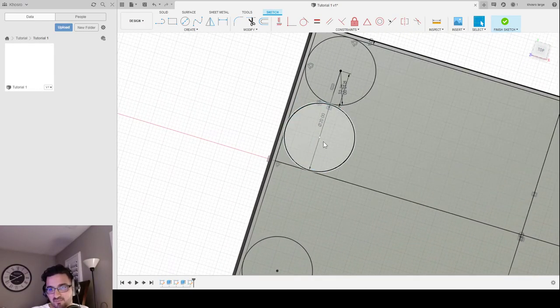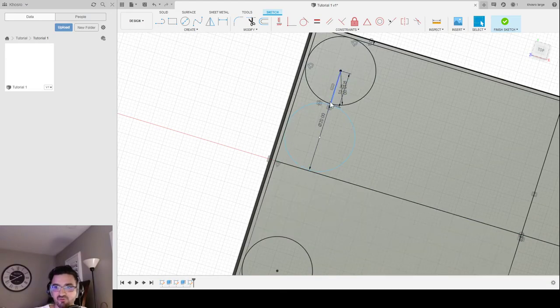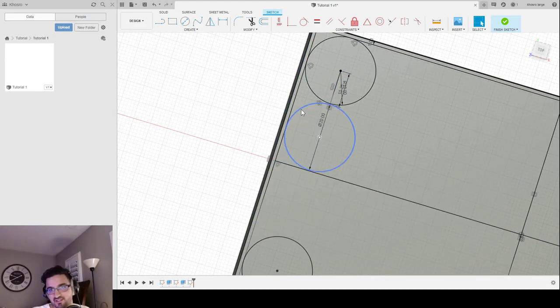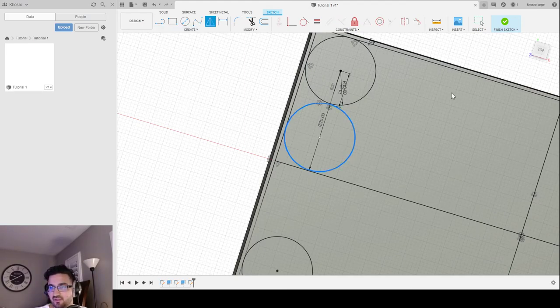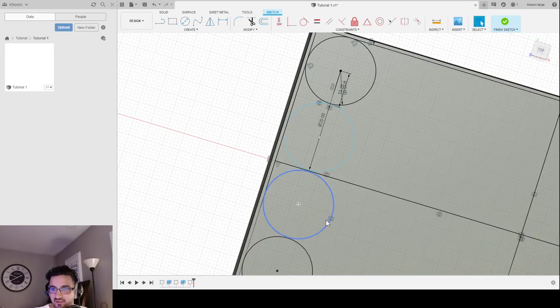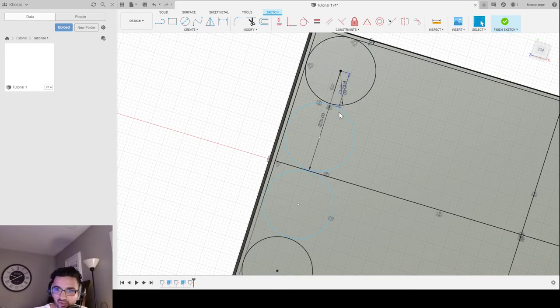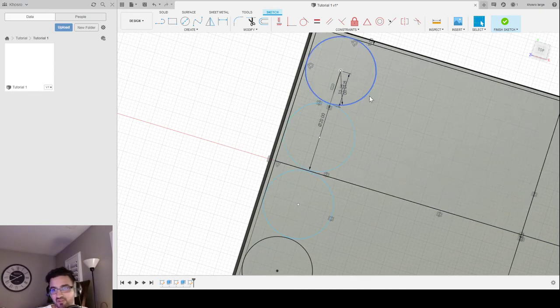Let's mirror this circle down so I don't have to draw lines and make a new circle — I just click a few buttons. Create, Mirror, select this circle, select this line, and there you go. I have basically a column done of the 24-well plate.